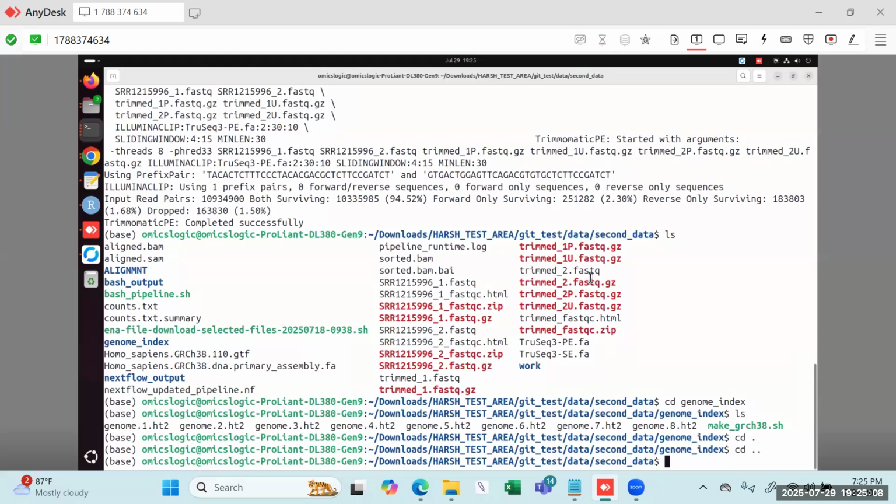That means you use the FASTQ files, and using that you generate your reference, and then you can perform this kind of analysis. But today we are not focusing on de novo because that is one of the technologies within itself. So here we are focusing on reference-based assemblies.